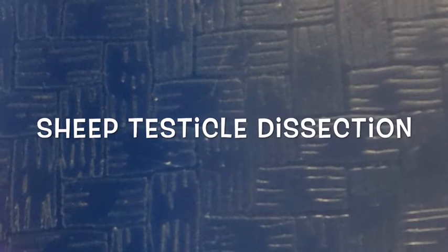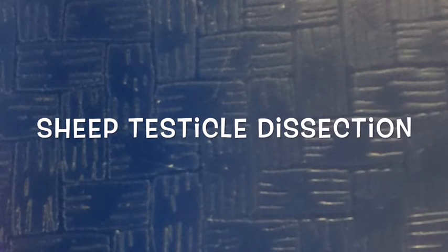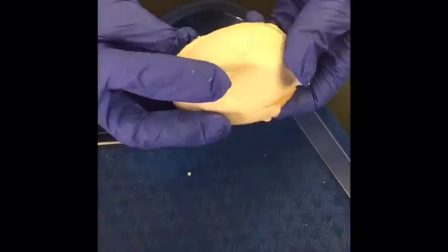This is a presentation on how to dissect and identify a sheep testicle. We are going to start identifying the parts first before we go further with incision.